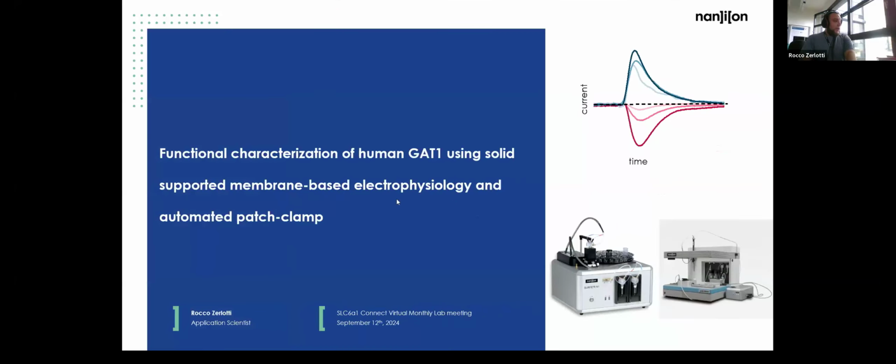Okay. Then, thank you, Amber, for giving me the opportunity to talk at the Virtual Monthly Lab meeting. And as the title says, today I would like to talk to you about how we characterize the human GAT1 or SLC6A1 using solid supported membrane electrophysiology and automated patch clamp. So we are more on the basic science here, if we want to say that.